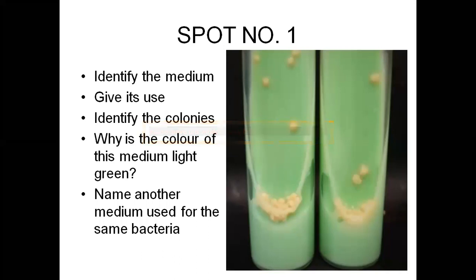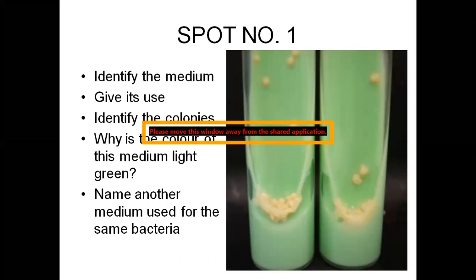Today, we are going to discuss culture media and biochemical reactions related to bacteriology and microbiology. Culture media and biochemical reaction are two important unobserved stations. So starting with the first spot, just like the previous OSPE, we have bacteriology and microbiology.